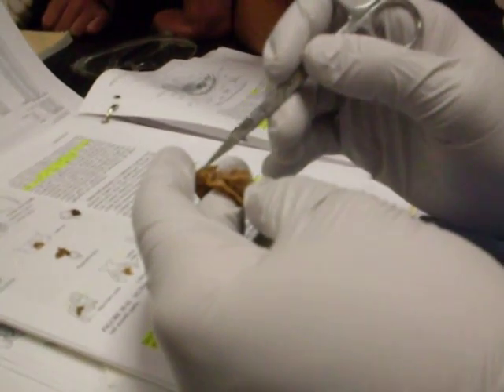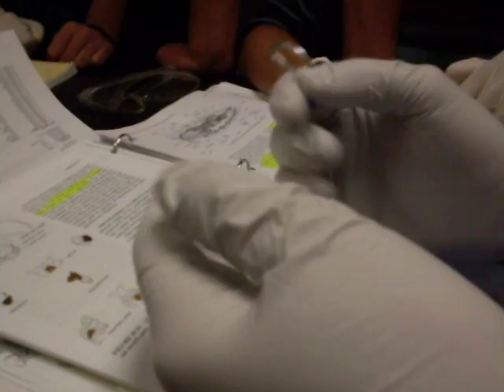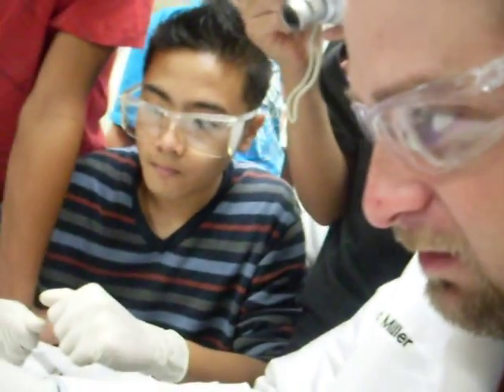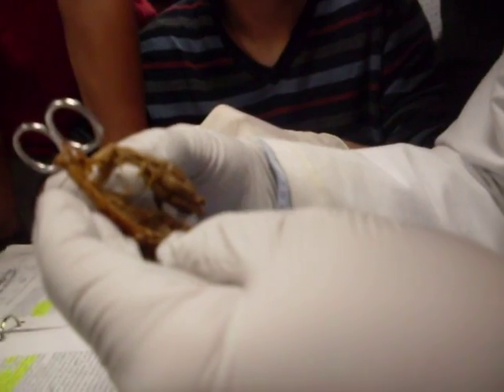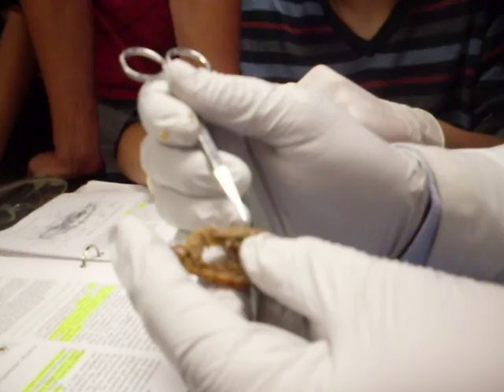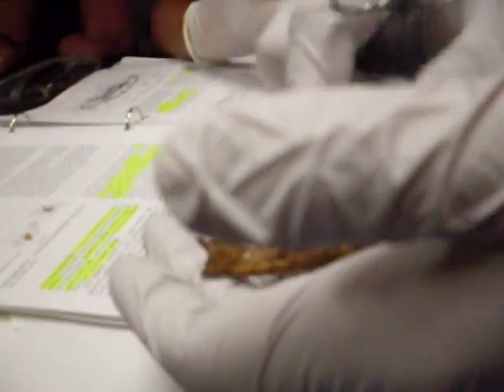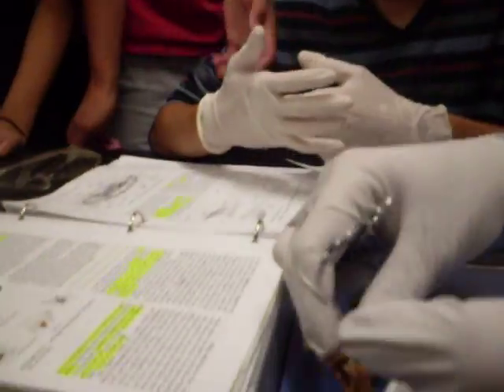Right behind it, it gets poofy again. What's that? Rectum. Rectum. Last thing? Anus. That's it. It's very, very simple. Not a lot here to remember. Now, we can look at the ventral side and let's see if we can see any nerve cord — we got a little, but not very good. We don't really mess with it because we never really get a good look.